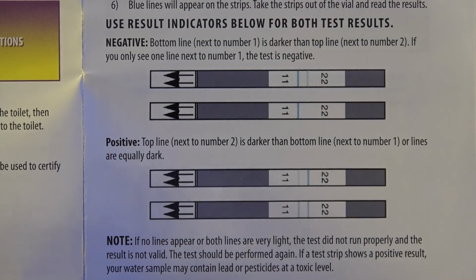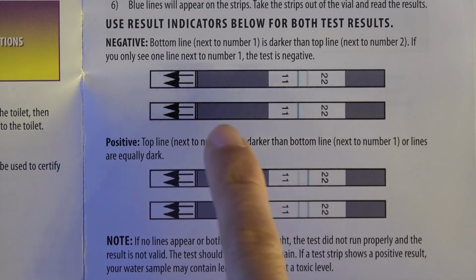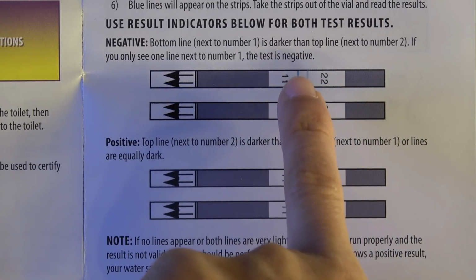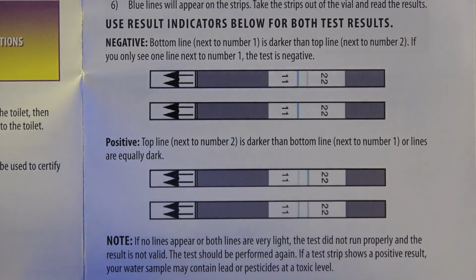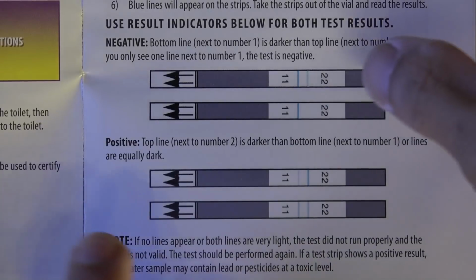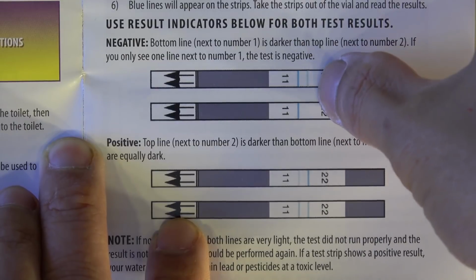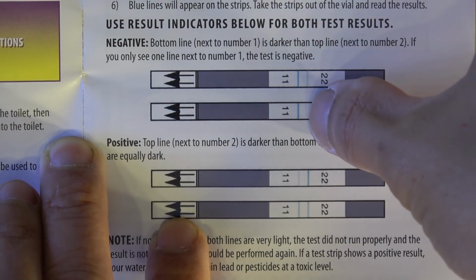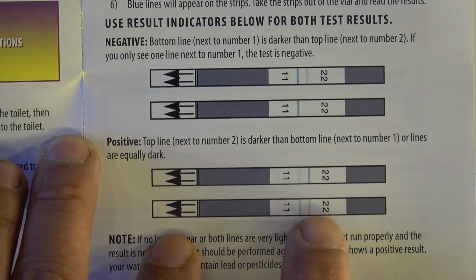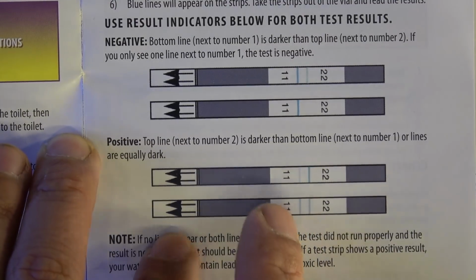So while we're waiting, let's see how this works. These are the test strips. You got the arrow on the left side here, so the result will appear here. The result will show up as blue lines. A negative result will give you the bottom blue line dark and the top line either not present or very dim. This is the positive result down here, which is the top line is darker than the bottom.